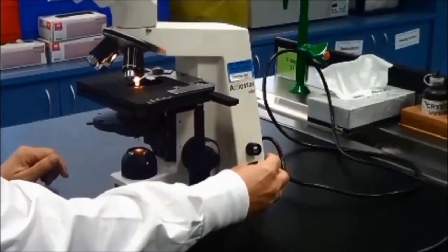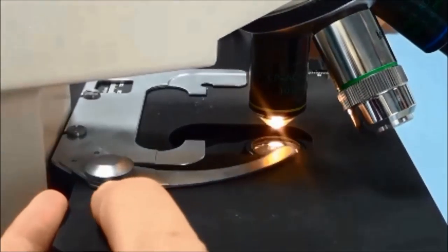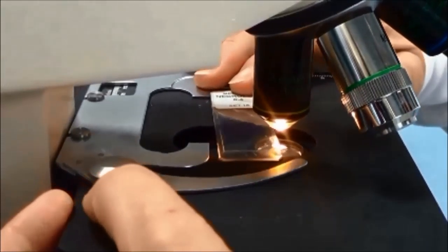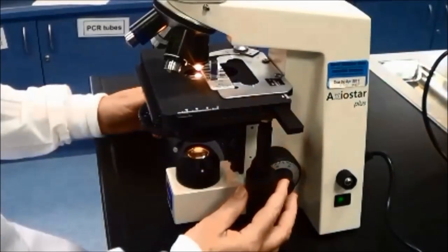Load the specimen onto the stage, holding it in place with the stage clip. Swivel the x10 objective lens, the yellow ring on the nosepiece, into place.